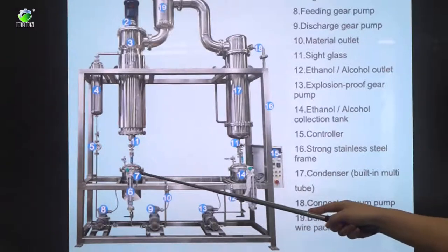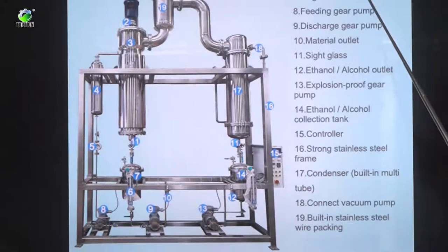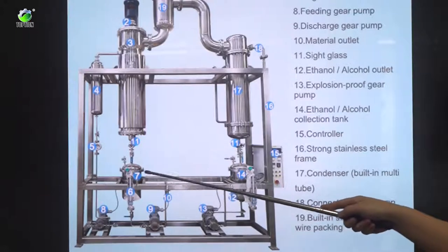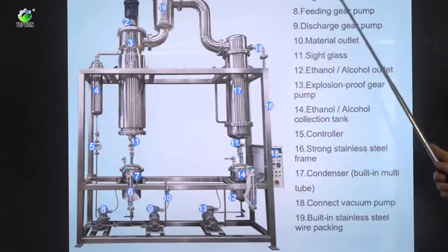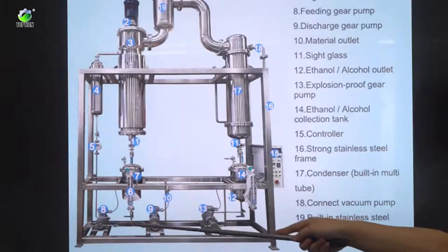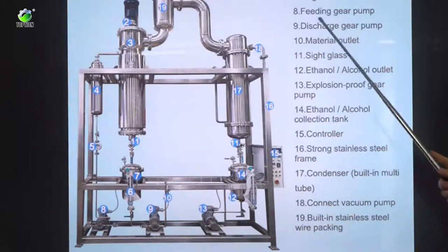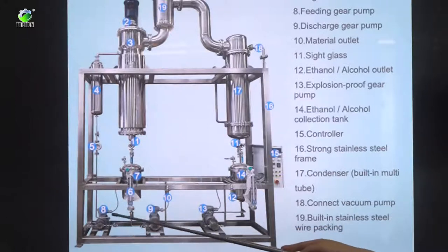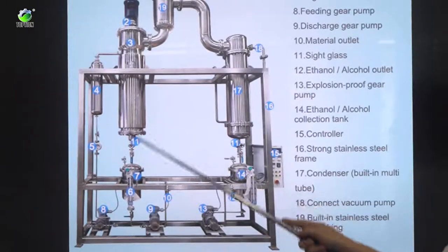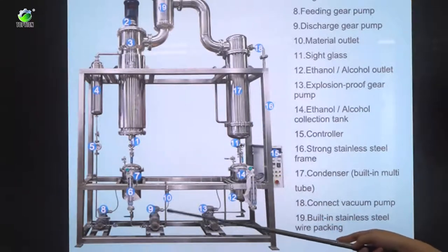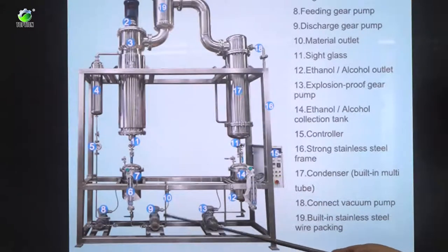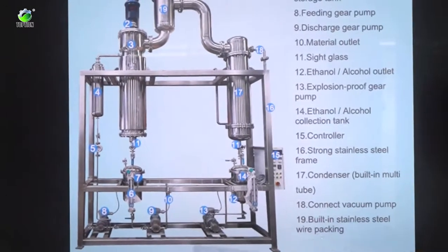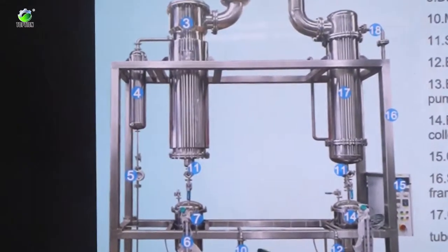And the seventh is condensed CBD oil storage tank. And here is the final product of the CBD storage tank here. And this eighth is the feeding gear pump. By these pumps the material will be feeding to the system. And this ninth is discharge pumps. After this the material will be collected. And this tenth is material outlet.